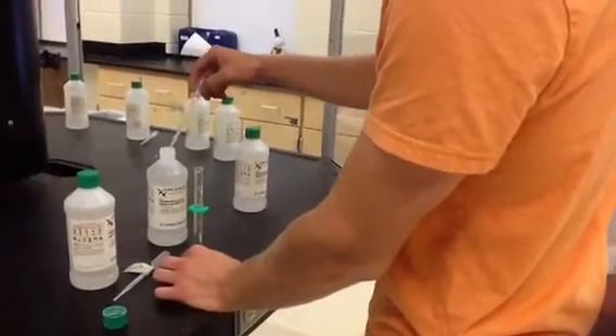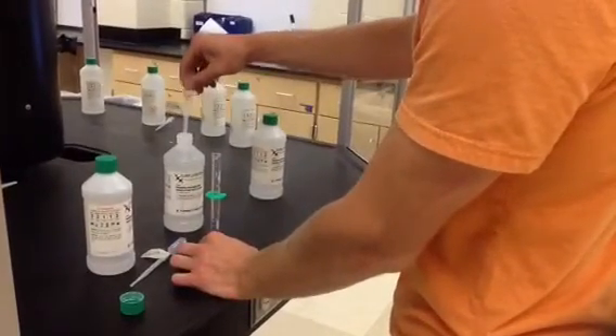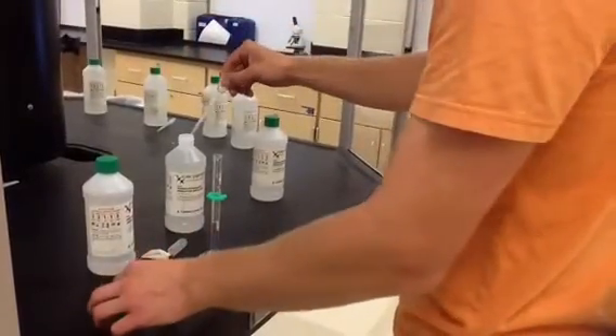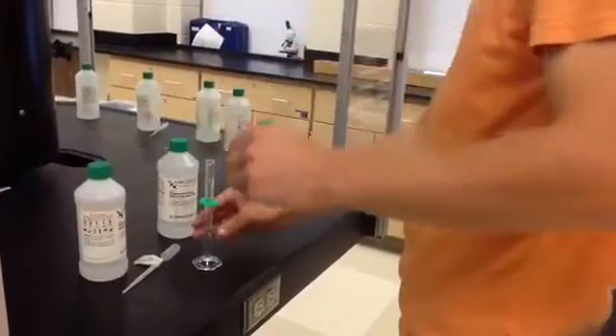Phenolphthalein, when exposed to base, will turn bright pink. He puts a couple of drops — literally just a couple of drops, because a little bit goes a long way. So he puts a couple of drops in, then takes it to his table.